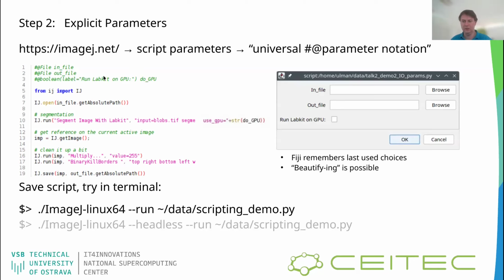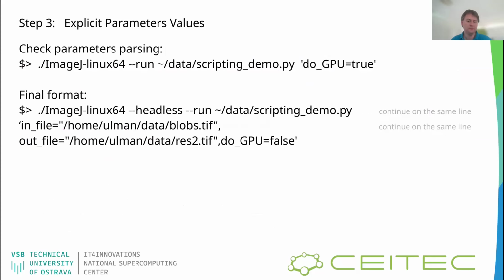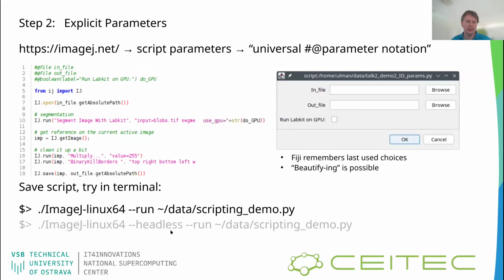If you run it in the Fiji in a GUI, it will give out this graphic user thingy where it asks you, and this thing is remembering your inputs there. So next time it comes pre-filled. And I had to modify the script a little bit to basically tell it, take the values from the variables. Now here is already a hint.